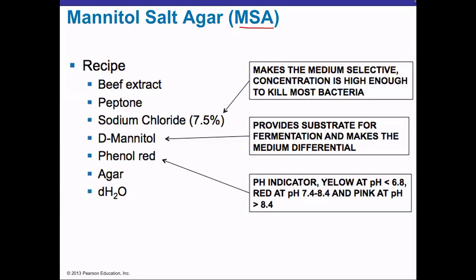If you look at this medium, here we are in the presence of a medium that is selective, differential, and complex. Why is it complex? Well, beef extract is the main ingredient that is making this medium complex. And then it is selective and differential.